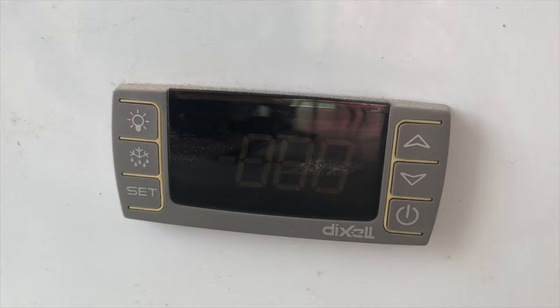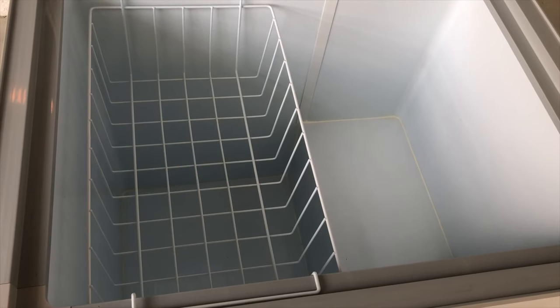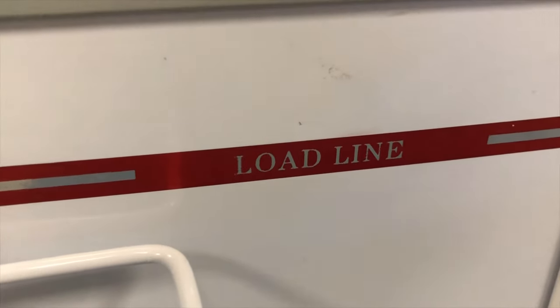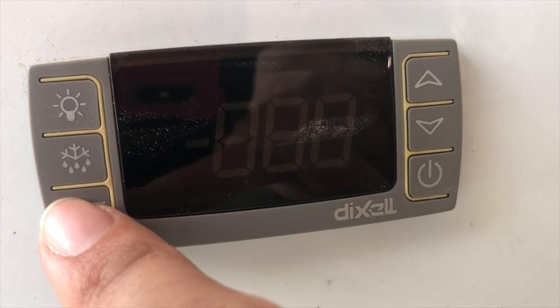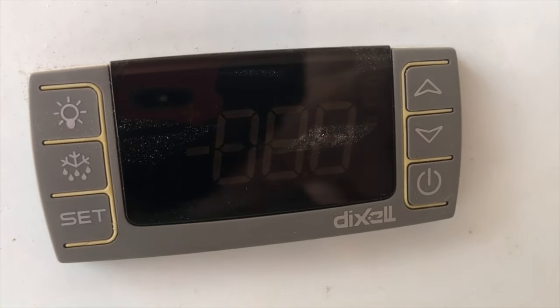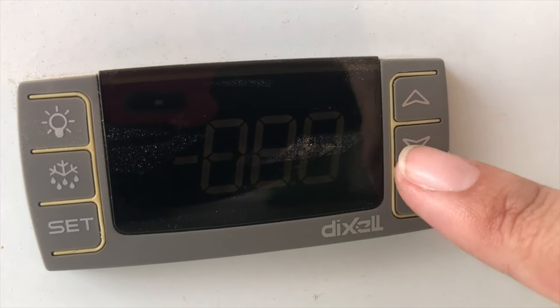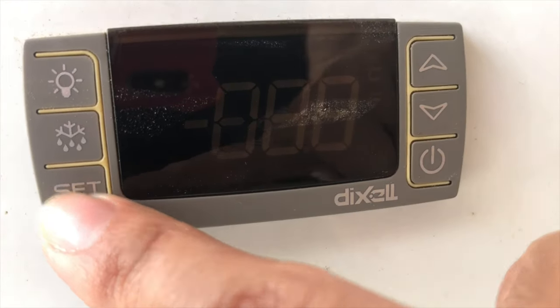The temperature is regulated with a digital thermostat — a Pixsys, to be precise. Setting up the thermostat is also pretty simple: all you have to do is press the set button, hold it for three to four seconds, then press the up and down buttons to set the temperature you want, and then press set again.